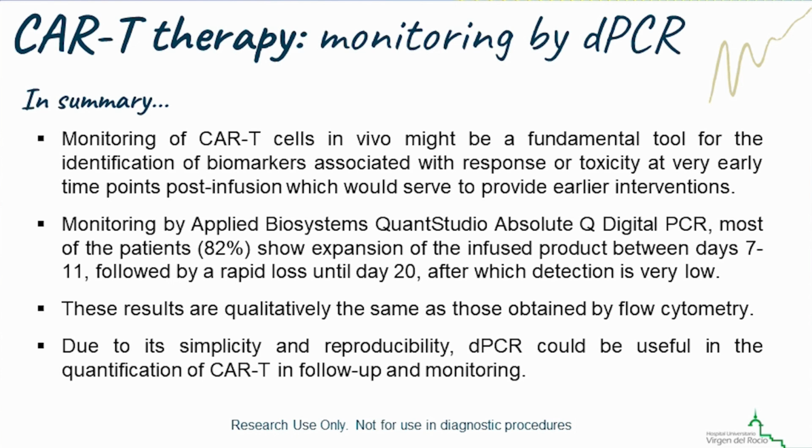In summary, first, monitoring of CAR-T cells in vivo might be a fundamental tool for the identification of biomarkers associated with response or toxicity at very early time points post-infusion, which will serve to provide earlier interventions. Second, monitoring by Applied Biosystems QuantStudio Absolute Q digital PCR.